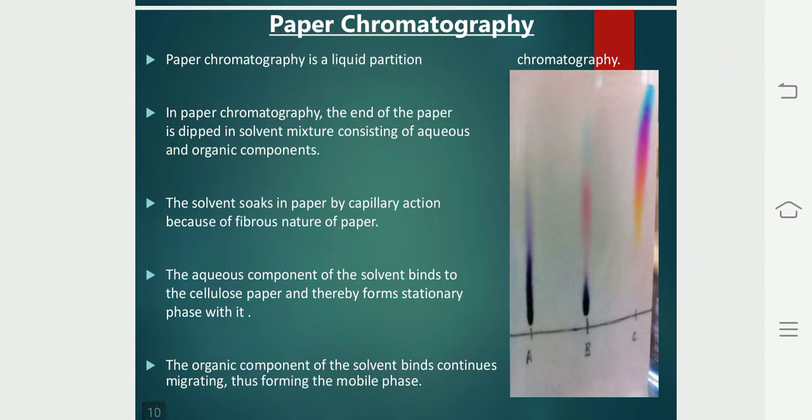Okay, now come to paper chromatography. Paper chromatography is an analytical technique, and it is used for the separation and qualitative analysis of components of mixtures, and for the purification and identification of compounds in a mixture of substances. By using paper chromatography, we can analyze the amino acid composition in a sample. We identify, purify and separate the different amino acids in a sample mixture.